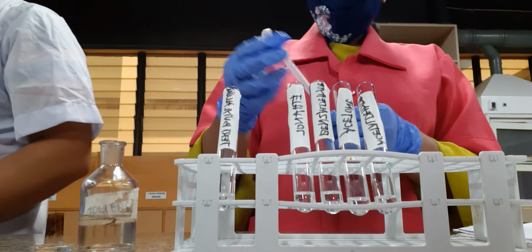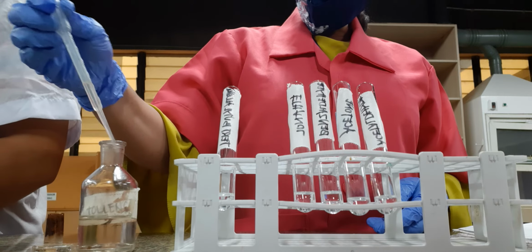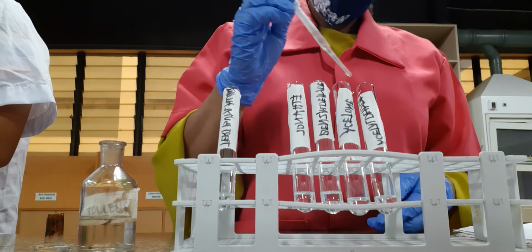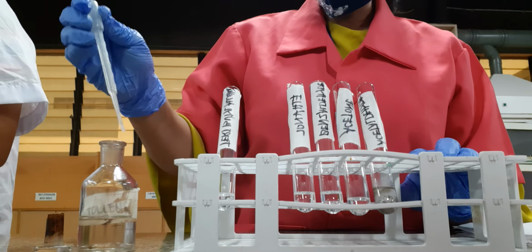Tollens test using the same volume of Tollens reagent. Okay, so we add to our first acetaldehyde. Okay, so take note.